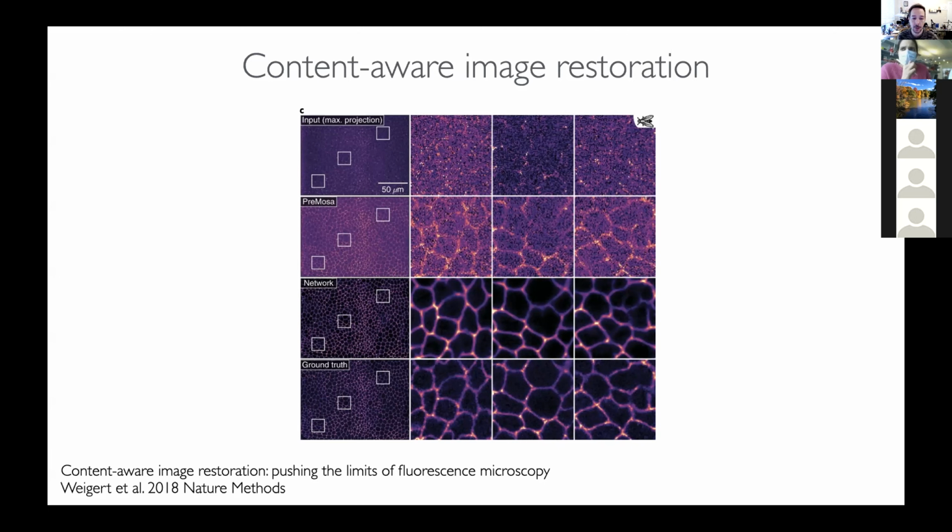And you can see in the image here just how noisy the image can be and still get a result that's very high SNR. And so you can think about why this might be good, like we talked about, live imaging, but also solving segmentation problems. If you have really good SNR, like what you can get from these trained networks, then solving where the cells are or where the boundaries are becomes much, much easier.